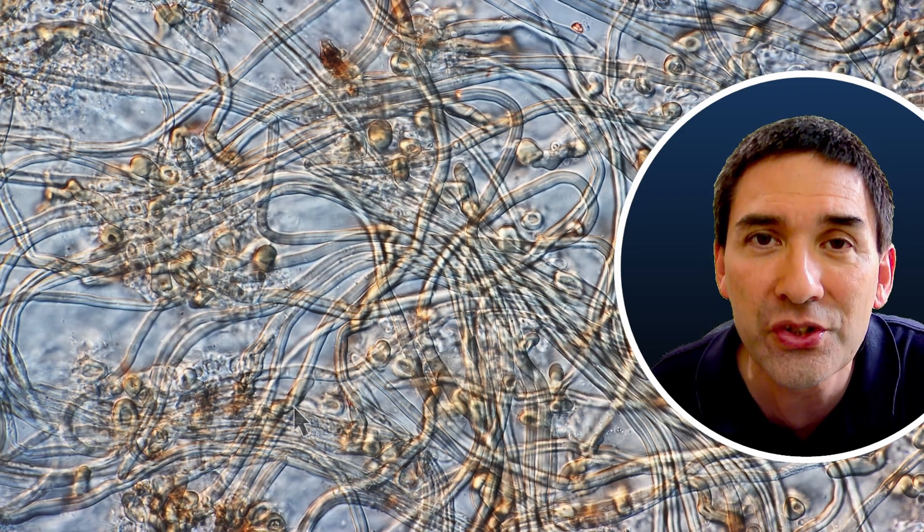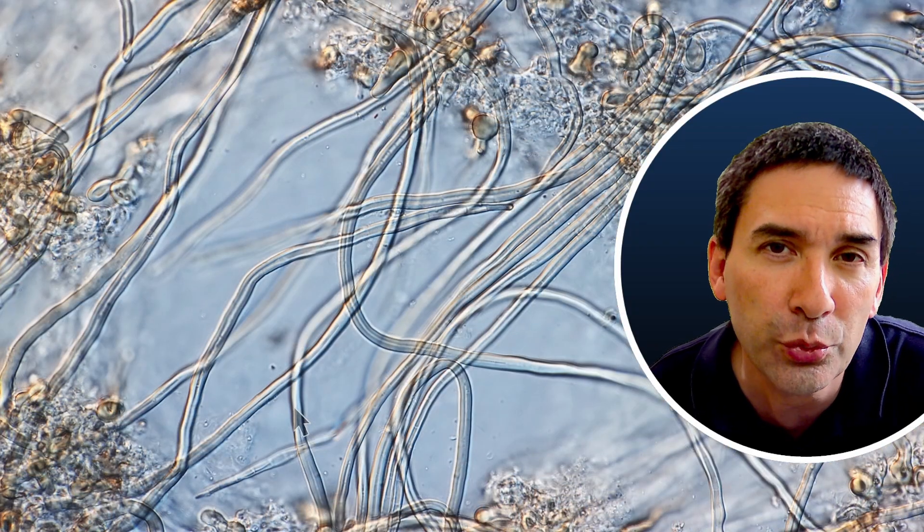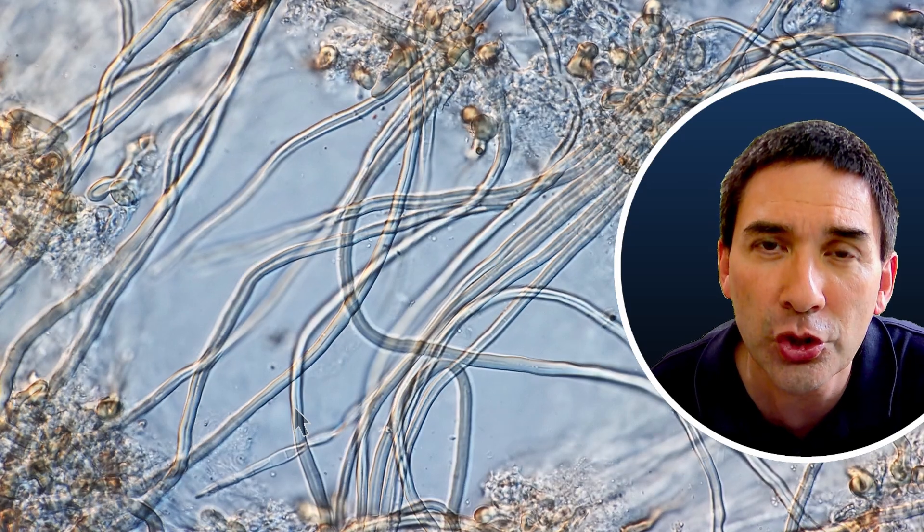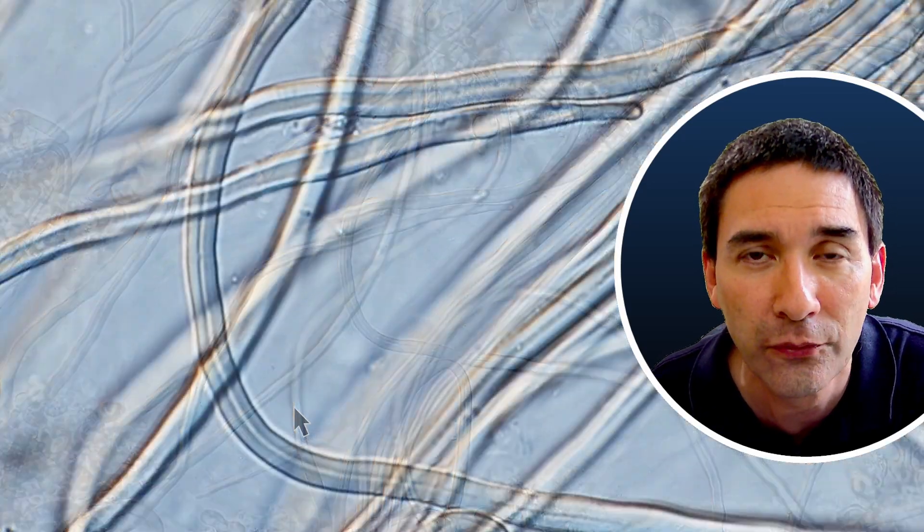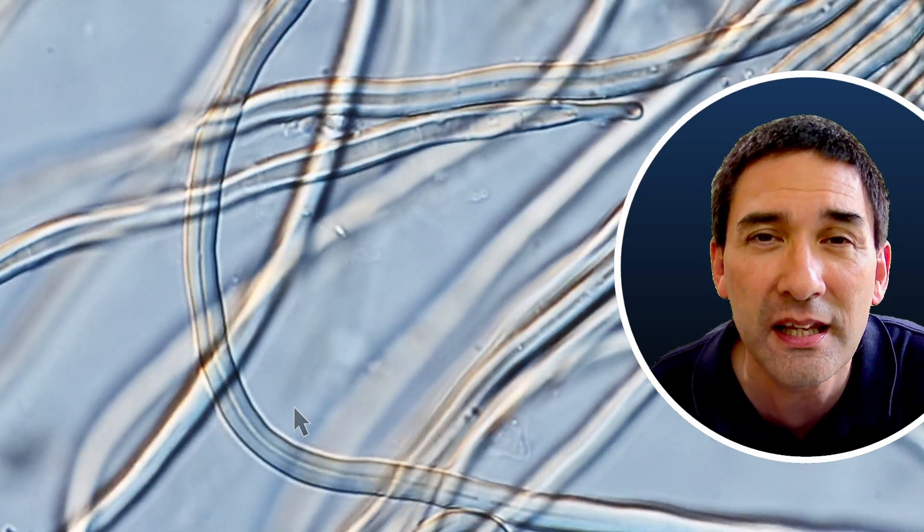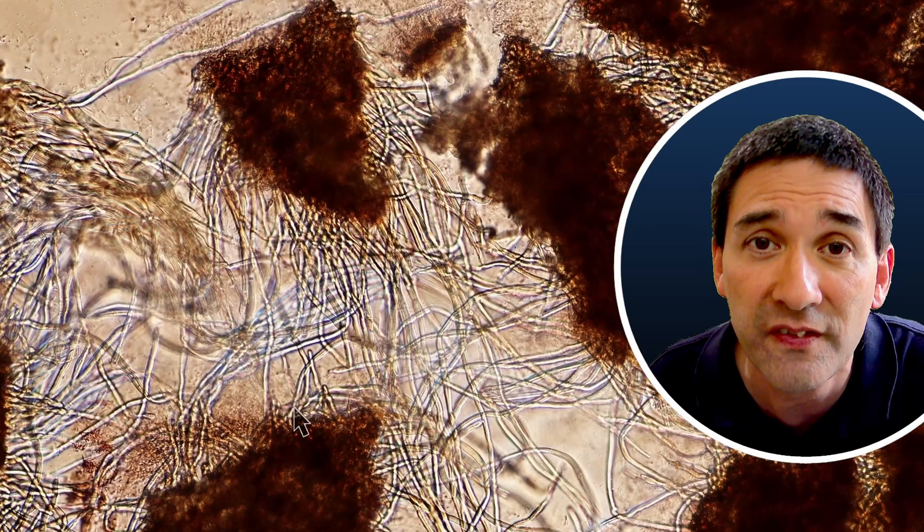But I was not able to see the individual cells of the hyphae. Rather it was like a continuum. They formed a continuum, a very homogeneous structure, but individual cells I was not able to find. Even at yet higher magnification you can see that it looks almost like hair or textile fibers, but there were no individual subdivisions visible here.